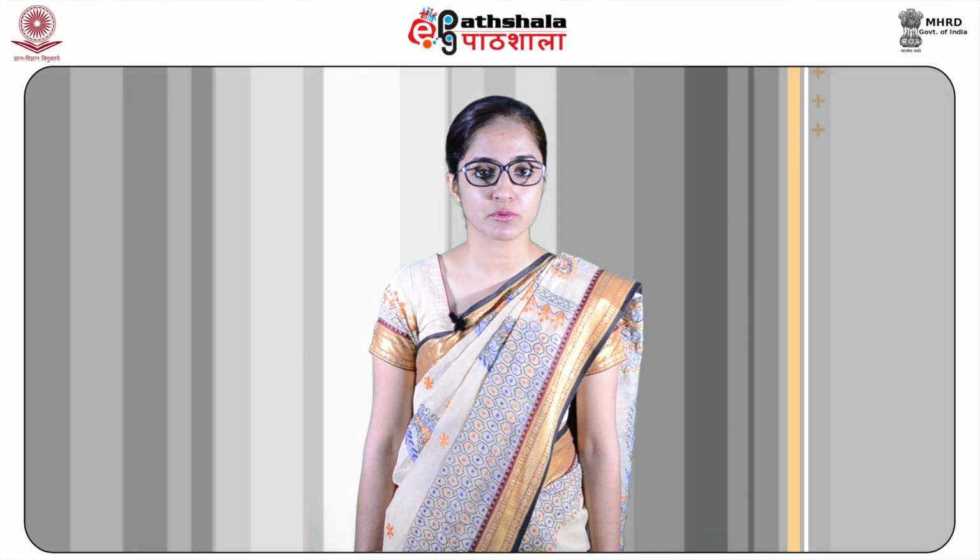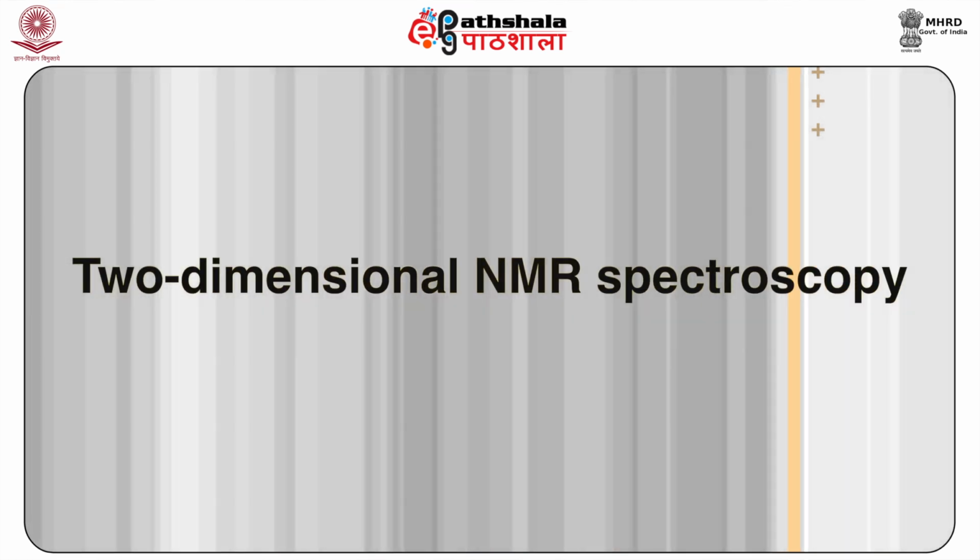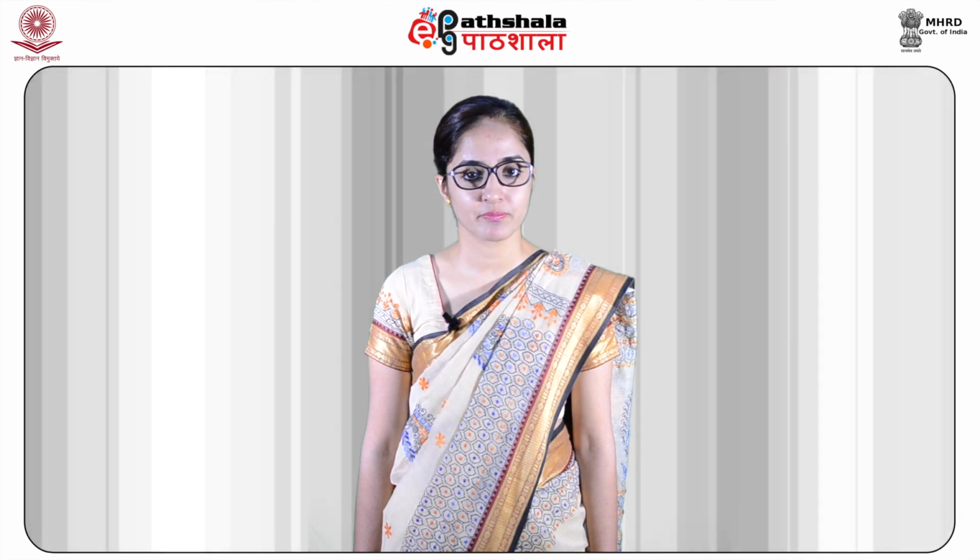Now students, let us discuss a very interesting aspect of NMR spectroscopy, that is two-dimensional NMR spectroscopy. Since the development of pulsed NMR spectroscopy, a number of advanced two-dimensional NMR techniques have been devised.